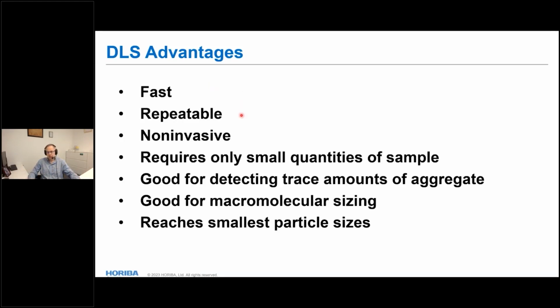It's repeatable. You have a good sample, and you have very tight repeatability, which lets you differentiate between fairly similar samples. It's non-invasive, so it's very easy to get your sample back and use it for other sorts of analysis. You have fairly dilute suspensions, and this means you need only small quantities of sample. If you only need 10 microliters of liquid and your particle concentration is in the high ppm, you're using next to nothing. It's a good tool for picking up trace aggregation. If that's what worries you, it's a nice tool.